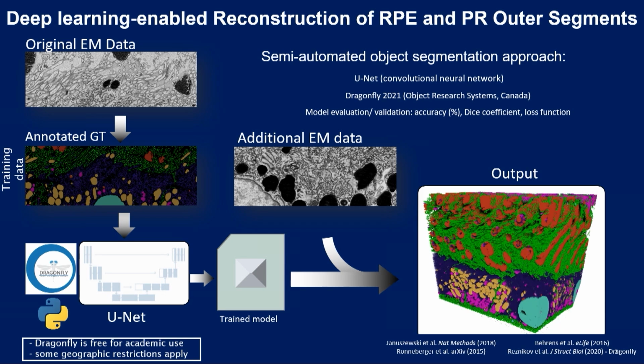And that's one of the cubes that we got from ORS. So this is the entire volume segmented into the individual organelles. So in turquoise, the nucleus, the green stuff that you see, those are all these apical processes. It's not quite easy to see them now, but they're all individual, like hundreds of thousands of spaghetti intertwined.